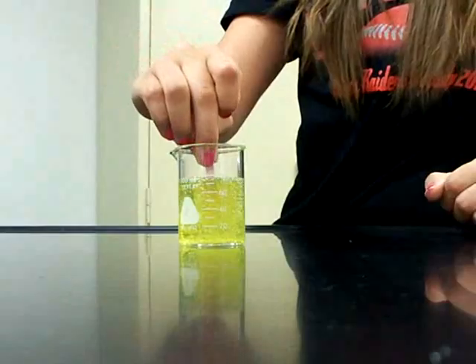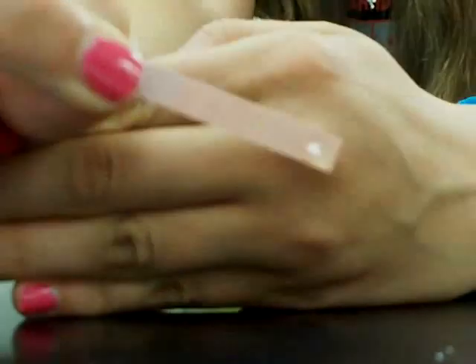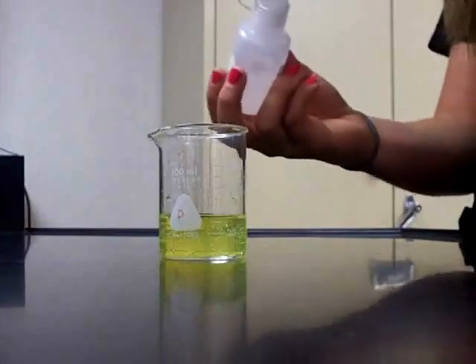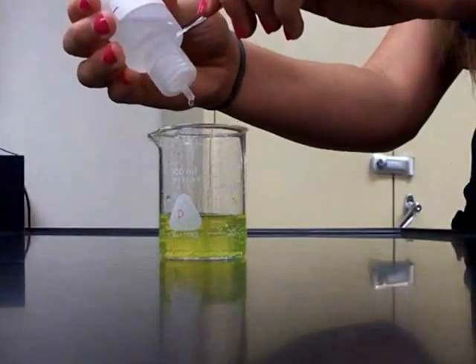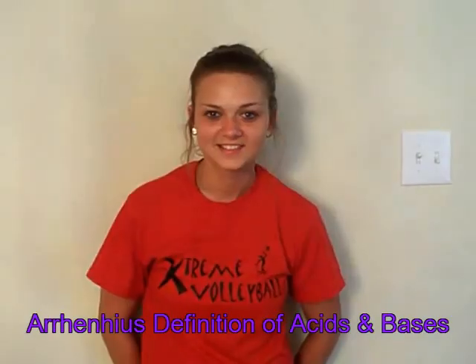Here is the red litmus paper. As we dip it into the Mountain Dew, we can see that the color does not change, indicating that it is not a base. This is phenolphthalein. As we add a few drops into the Mountain Dew, we can see that the color does not change, indicating that it is not a base.